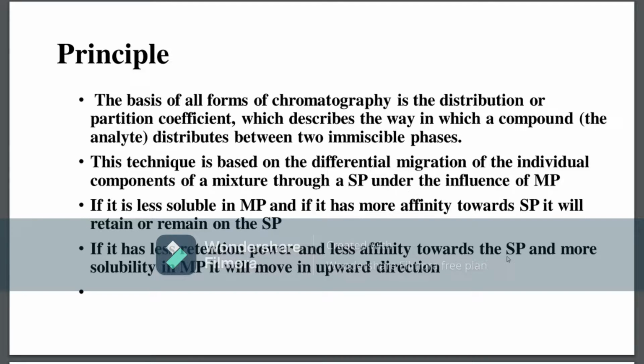Now, the basic principle behind chromatography is that the basis of all forms of chromatography is the distribution or partition coefficient, which describes the way in which a compound distributes between two immiscible phases, the stationary and the mobile phase. This technique is based on the differential migration of the individual components of a mixture through a stationary phase under the influence of a mobile phase.